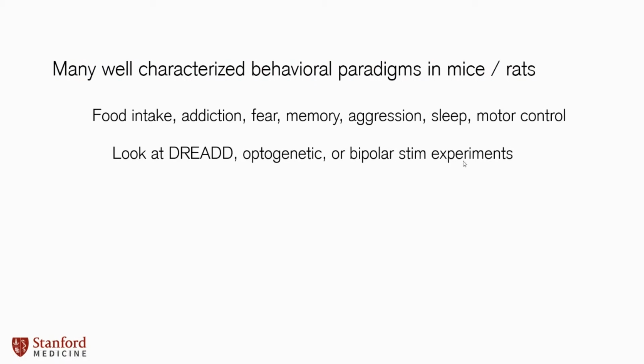So for ultrasound, if you don't know where to start, look at your fields, find one of these experiments and just copy it, and just target your ultrasound to that brain region. And we'll get into how to do that in a little bit, but that's sort of a preface on that methodology. And then, of course, I wouldn't advise thinking about experiments as an all-in-one. You don't have to measure your neural response while you're looking at behavior. You could do the neural response and then try to correlate that to behavior afterwards, which is pretty common.